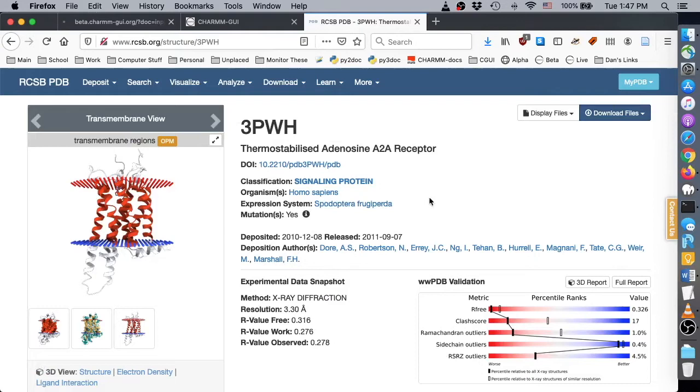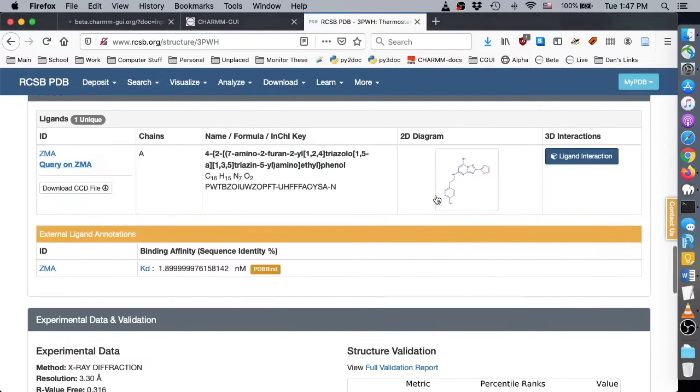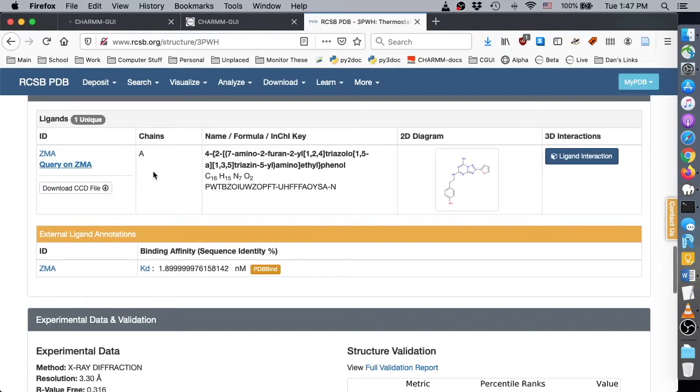On the RCSB page for this protein, you can see a binding agent ZMA. We will only use this ZMA as a reference for the positioning of our ligands. Note that the OPM PDB file does not contain TER records between atom and hetatom records. Because of this, CharmGUI often fails to recognize ligand molecules.